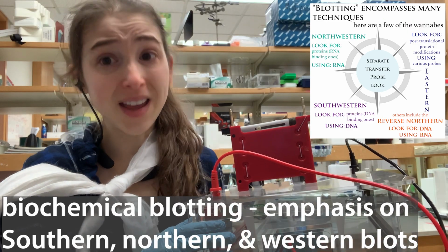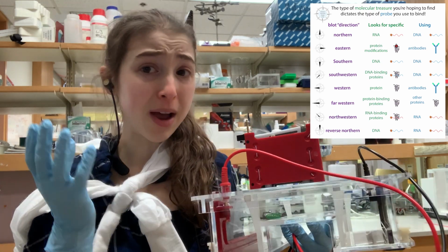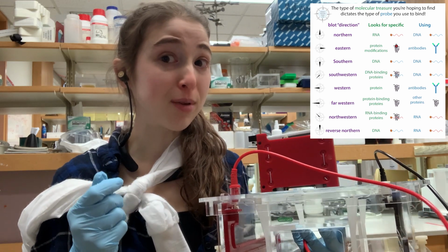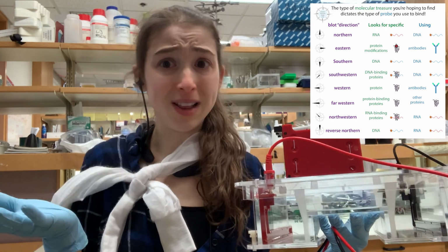Northern, southern blot, and there are others, I kid you not, but no matter what direction is in the name, the basic premise is the same. Take some biomolecules and separate them, typically by size, then transfer them to a membrane and probe to analyze. If the probe finds a match, a band you will see, but what kind of molecule will it be?